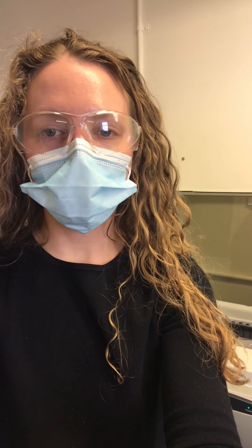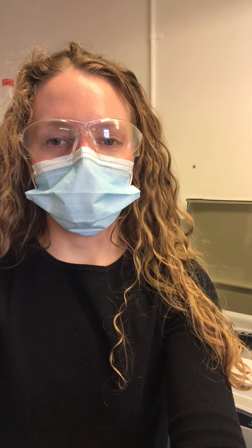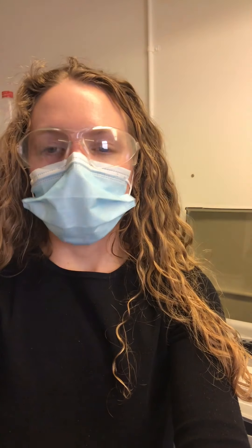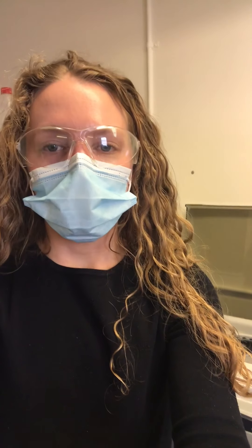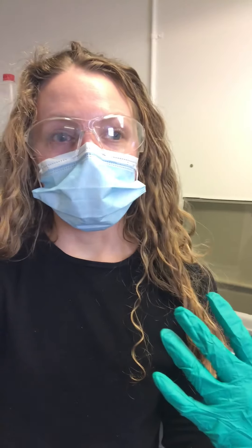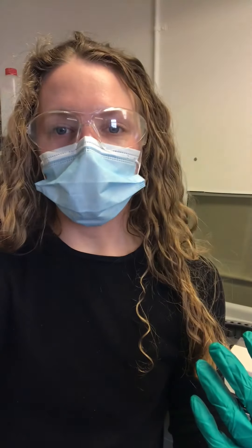I mentioned how I calibrate the machine up to 500 milligrams per liter, and sometimes in Pheasant Branch Creek we see concentrations that exceed that calibration standard, which is very concerning. Chloride is a naturally occurring element. In our fresh waters, without anthropogenic or human impact, we can see chloride concentrations usually around 0 to 10 milligrams per liter from natural demineralization of rocks breaking down. Water is really powerful, and as it flows it wears away at rocks. So there is a little bit of chloride, but nowhere near 500 milligrams per liter.